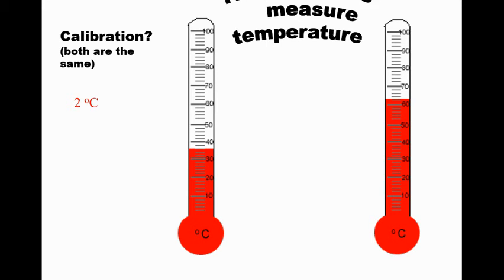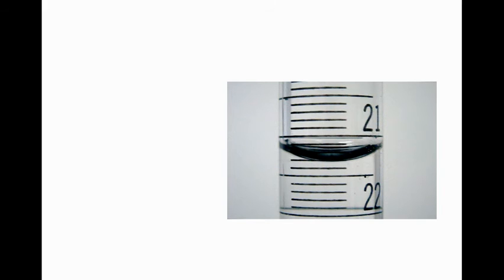Thermometers have a typical calibration of 2 degrees Celsius. So you have to be careful that you recognize that each line is worth 2 degrees. So it's 3 lines up. That doesn't make it 33. It makes it 36. And then I'll add an estimated digit of 0.0 because I think it's right on the line. I can also think it's halfway through the line, and this one would have a reading of 62.5 degrees Celsius.